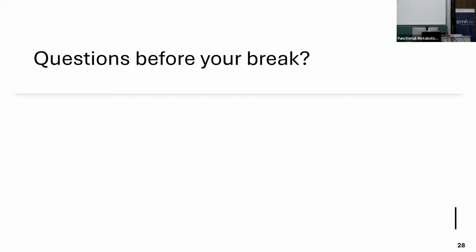Yeah, probably. It's a really interesting question. I would be curious what people in the audience do. For me, and that's totally subjective, technical replicate means actually replicated injection to the mass spec, which is very low and very conservative. Unless you do things like DDA, MS/MS of very complex samples, then you actually have a huge variance on MS2 level, not so much on MS1.